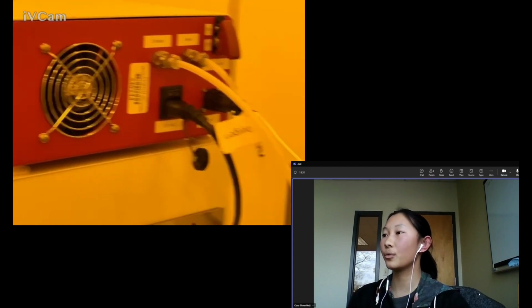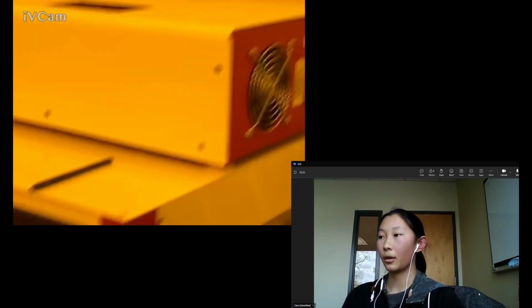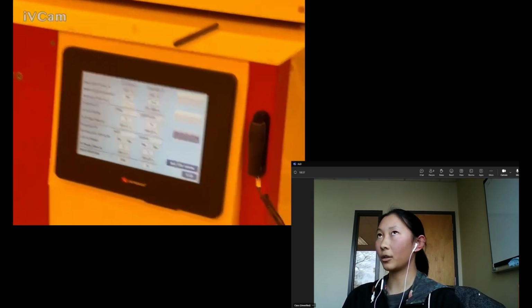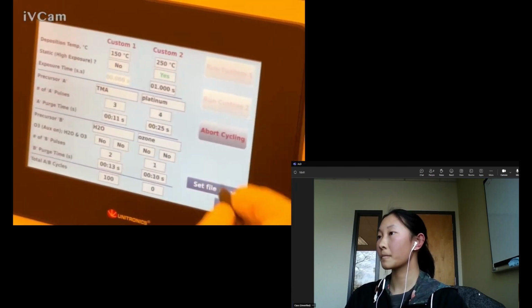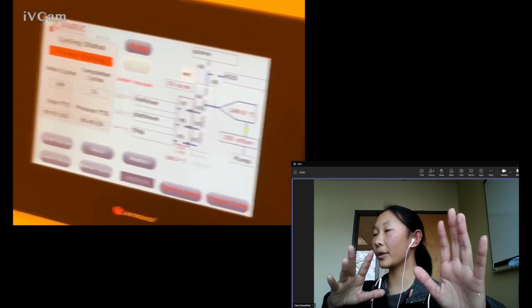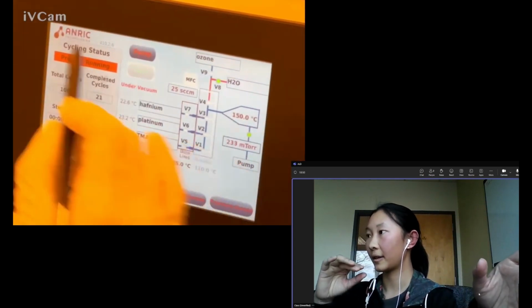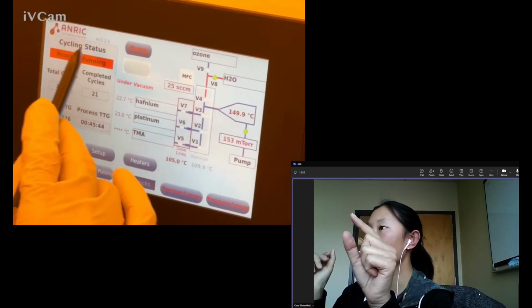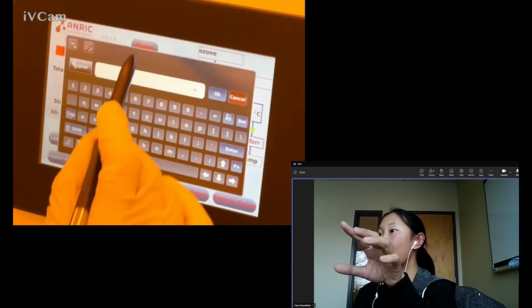So now we're gonna go back to the tool, the actual tool, and go to the main screen. And then you see the logo in the top left, and then the little numbers, the 410? Yeah, like 410, the software. You're gonna hold down there.